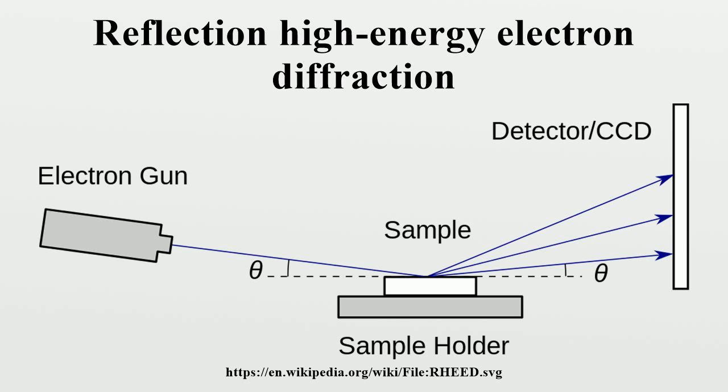Figure 3 shows a cross-sectional view of a single row of reciprocal lattice rods fulfilling the diffraction conditions. The reciprocal lattice rods in Figure 3 show the end-on view of these planes, which are perpendicular to the computer screen in the figure. The intersections of these effective planes with the Ewald sphere form circles, called Laue circles.